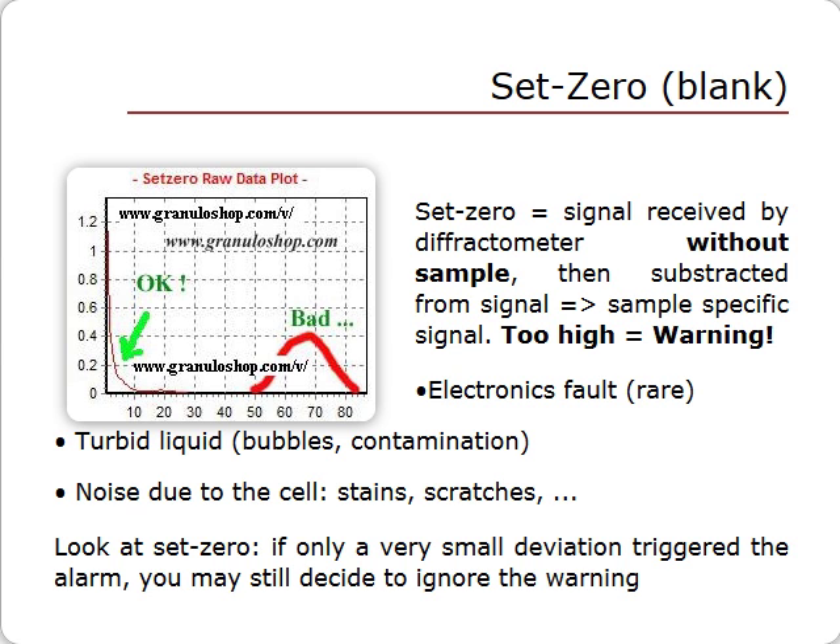If the set zero is too high, a warning pops up. Possible causes are: failure in the electro-optic device — this is extremely rare — liquid that is turbid due to bubbles, contamination or pollution, or noise generated by the cell itself caused by stains or scratches.